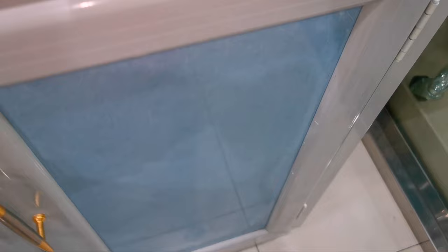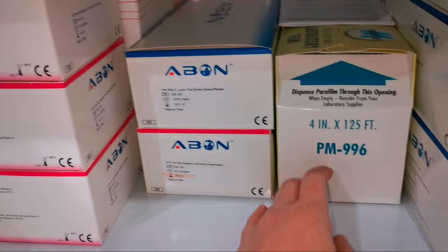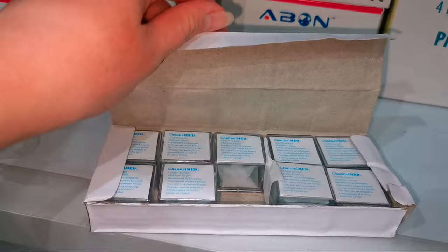Now let's move on to the next cabinet. These are the stocks of our test kits. Parafilm, cover slip, filter paper.